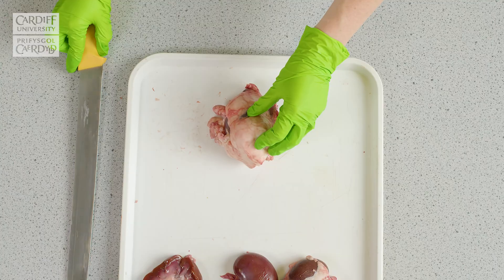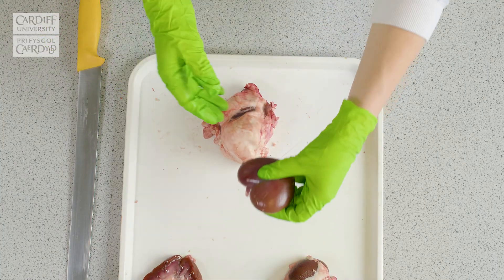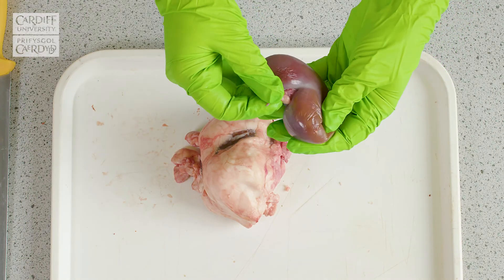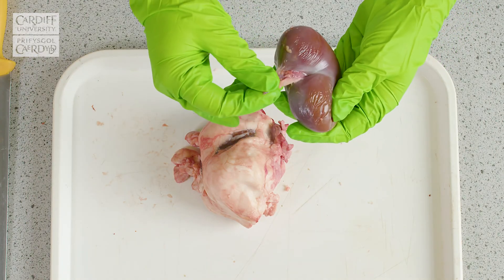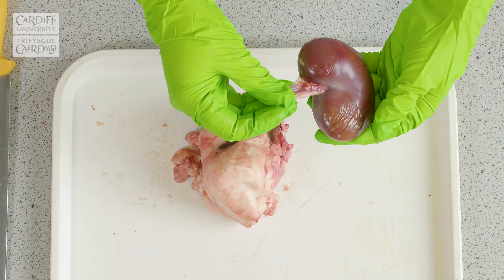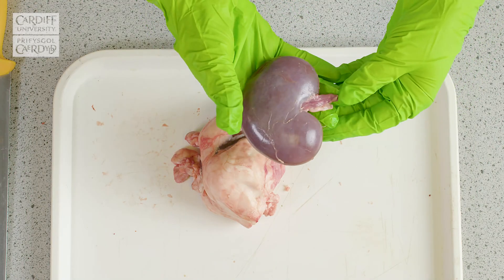In order to do this, we recommend orientating the kidney so that you identify the region of the hilum, which is where the structures enter and exit the kidney itself, which is easier to see when the fat's been removed.